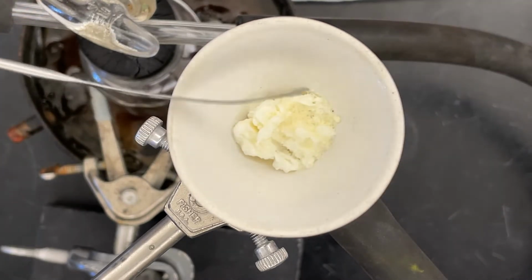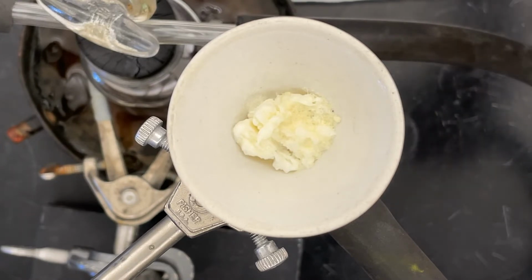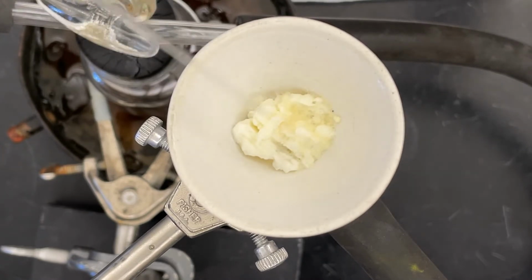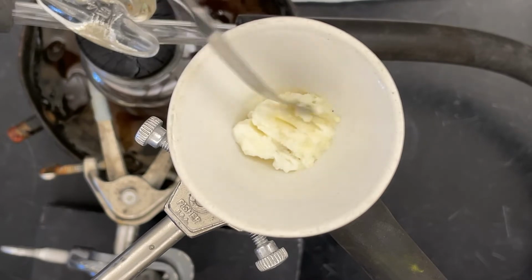All right, and we'll rinse this with a little bit of water now. I've already used about 1 mil. I'm going to use 2 more. Going for areas where I see a lot of color. Breaking it up a bit.